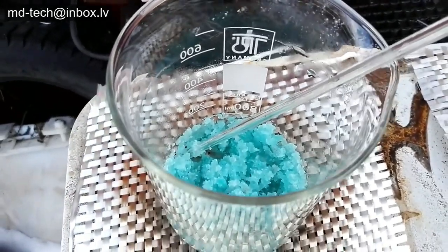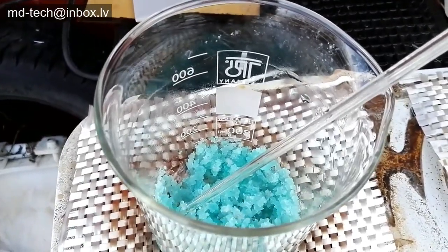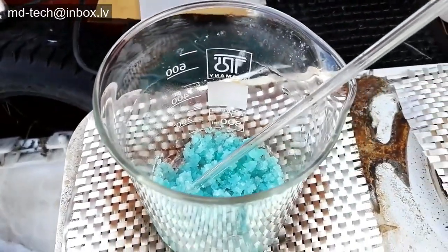This salt contains a little sulfuric acid. If you want to eliminate the acid, use an iron rod and place it overnight. Then evaporate the liquid and you get pure ferrous sulfate.